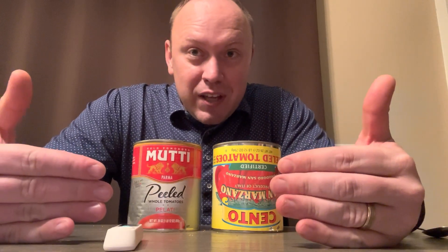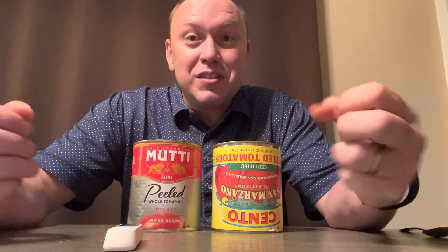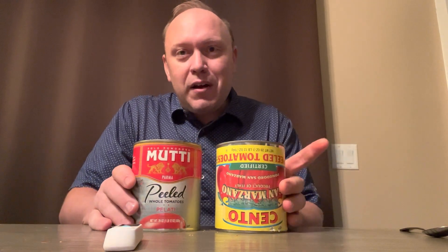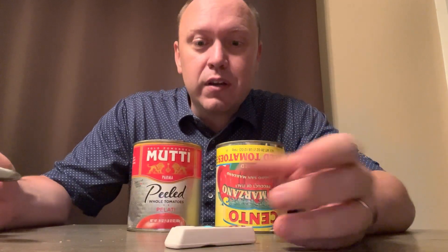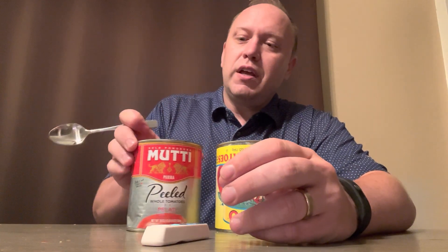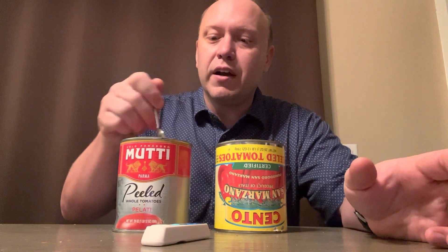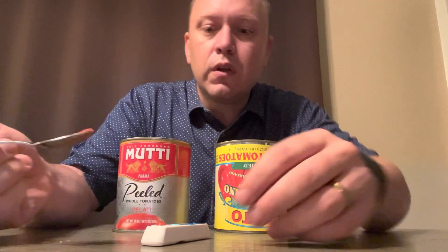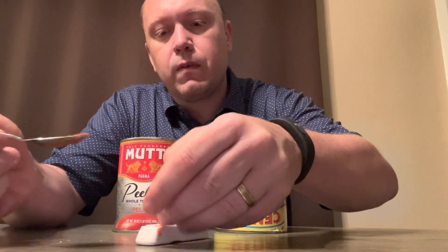I do a lot of tomato taste tests, and part of the taste test is how sweet are they, how acidic are the tomatoes — and I rank them on my website. Now we're going to get into some measuring. We're going to take this tomato — neither of these list sugar as an additive, I should say — and then we're going to just cover it with a drop.